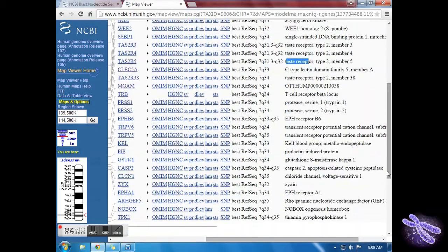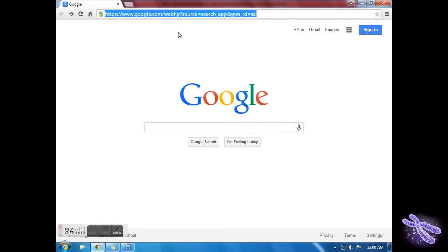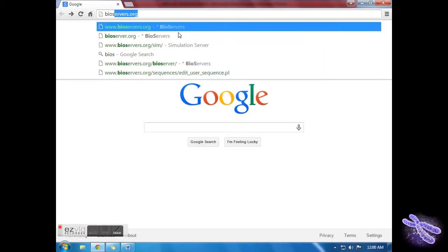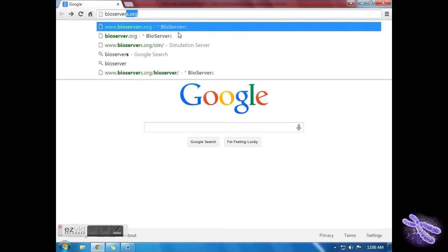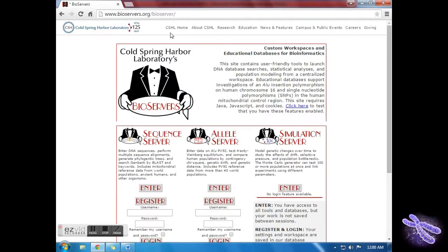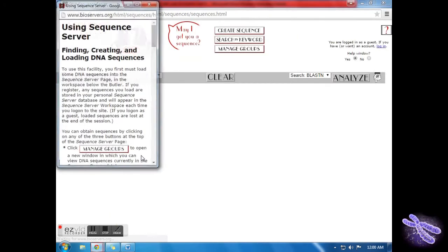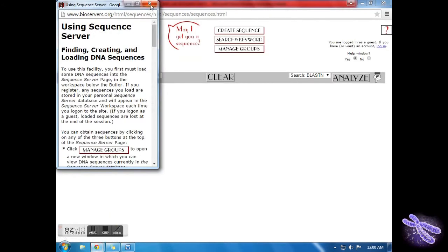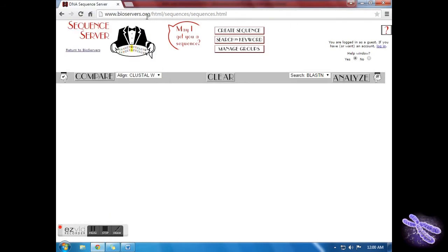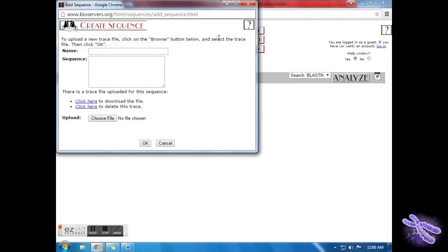Now for the last part on bioservers.org. Go to bioservers.org by typing it into the address bar. Click the enter button under sequence server on the left hand side. Click create sequence.